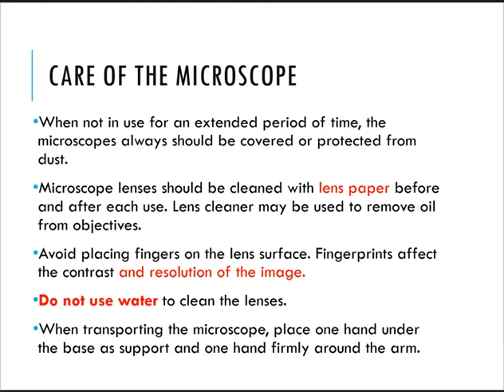And then your microscope lenses should be cleaned with lens paper before and after each use. Before and after, guys, okay? And lens cleaner may be used to remove oil from objectives. Avoid placing fingers on the lens surface. Fingerprints affect the contrast and resolution of the image.